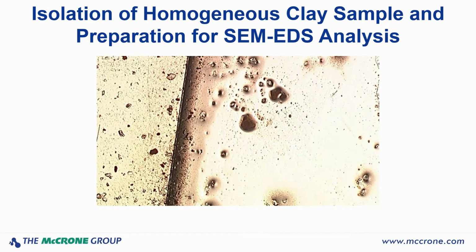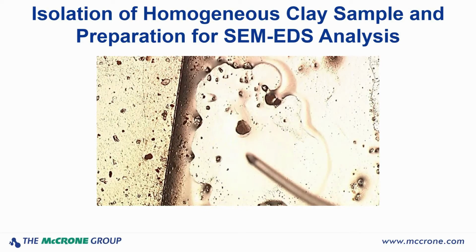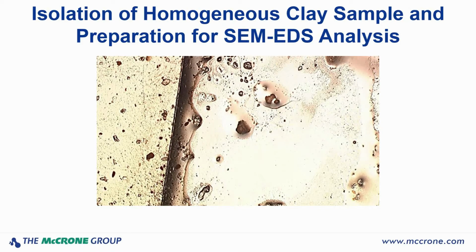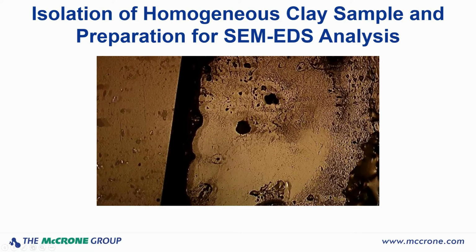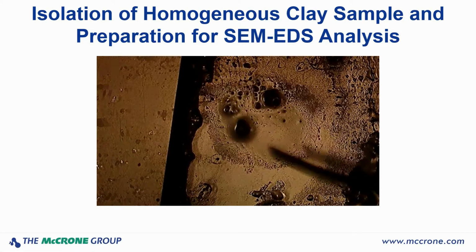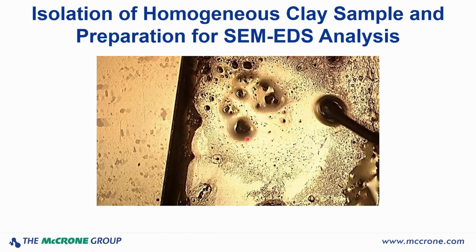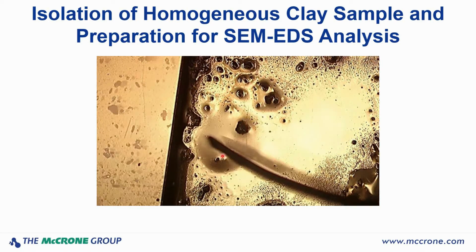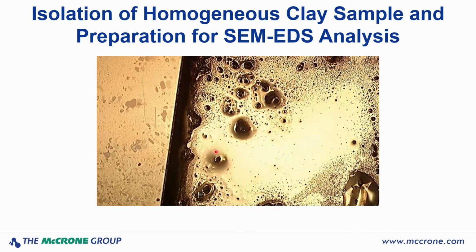Now we're going to bring in that micropipette tip with amyl acetate in it. We drop the amyl acetate on. We are still in transmitted illumination, so we can't really see our particles very well. I'm going to switch over to coaxial illumination. We can see our liquid much better. We can handle it. We can do some fine movement of that liquid. So I'm just doing some gross washing of this area.